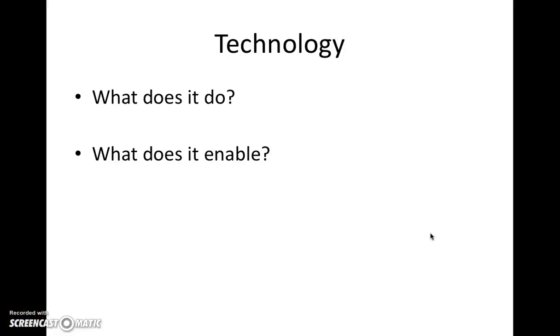It is a flexible simulation that has been translated into a number of different languages, and because it's placed online and is open source, it is available for anyone in the world. Now, because this is a virtual lab and not a physical lab, the resources that are available to students and teachers are essentially limitless. There's no concern with finances, so any chemicals, any glassware, any materials that really are needed in introductory chemistry labs are available for people who are using this software.